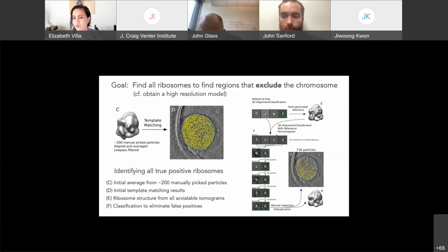And then you start to do classification in your tomogram. He figured out a clever trick, so to say: he did classification, and as long as the ribosomes were in a good category, in a large class, they would be deemed particles that are ribosomes, and the rest he would just toss, and then iterate that until he decided that all of the particles they had were ribosomes. And I think Zane told you about what happened once we had all of the ribosomes in place that we were sure were true positive ribosomes: that was used basically to do the chromosome calculations.